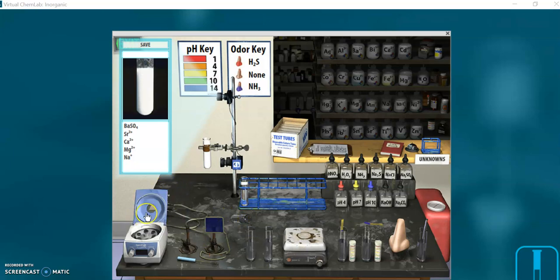Now, just as we do in real lab, we're going to use a centrifuge. It's a whole lot easier here. You just click on the centrifuge and it spins it right there. Don't try to drag it over. It will never land in there. It's much easier than that. You just click it like I did. You can see it spun down precipitates at the bottom.